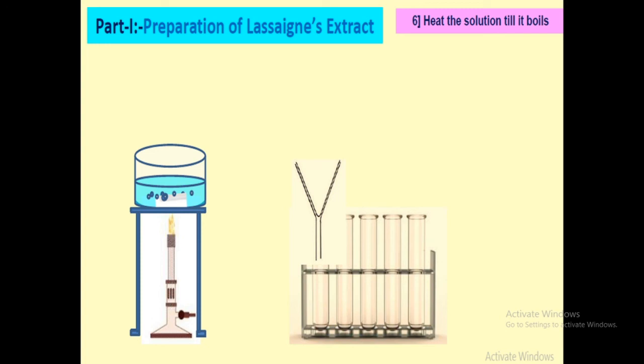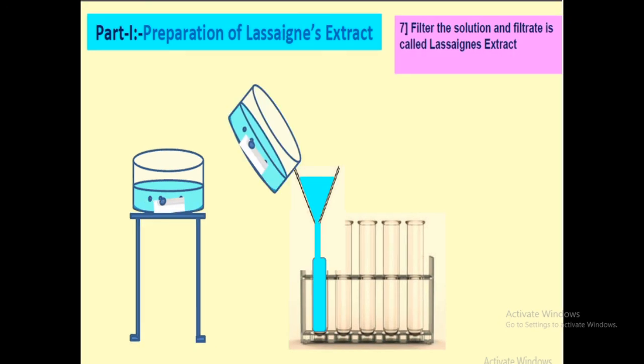Preparation of Lassaigne's extract is a very delicate and complex process in which we have to take care of all the things. That's how we can prepare the sodium fusion or Lassaigne's extract. We filter it into three tubes and now we have three tubes having sodium fusion extract, which can be used for further detection of elements like nitrogen, sulfur, and halogen. Thank you so much.